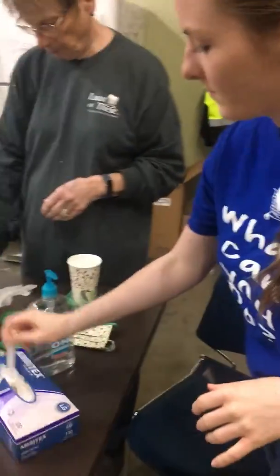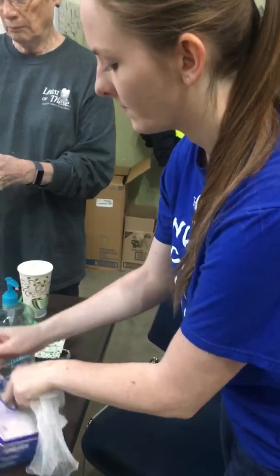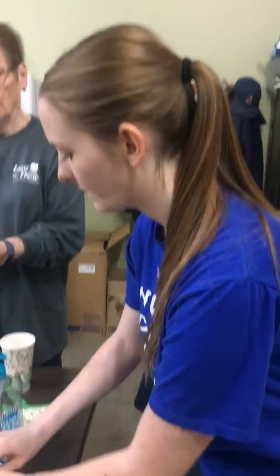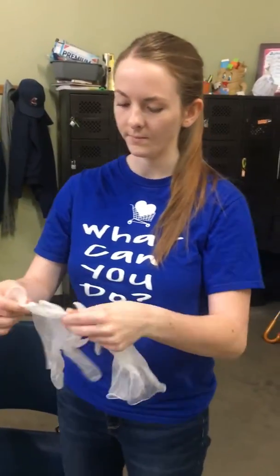Okay. Now Grace is going to put her gloves on. And if you can, use a glove that fits you well. It's a little hard. Sometimes we have to use big gloves and they're a little uncomfortable.